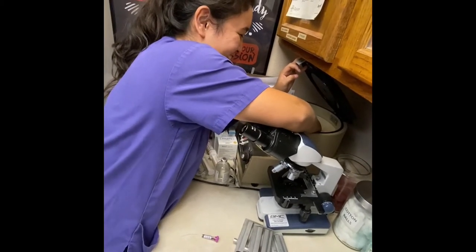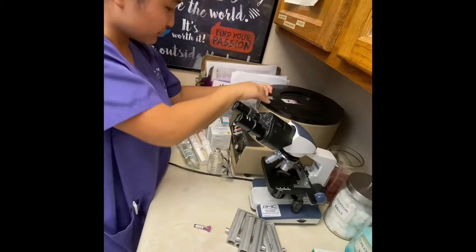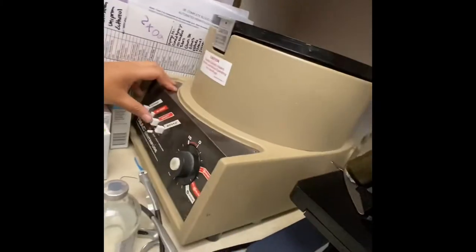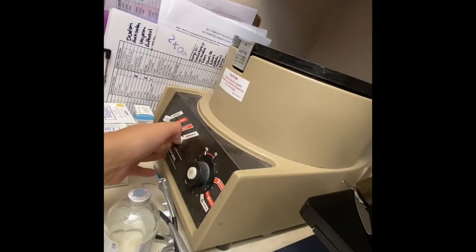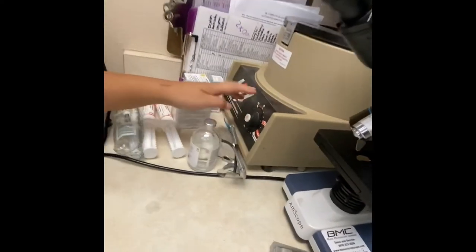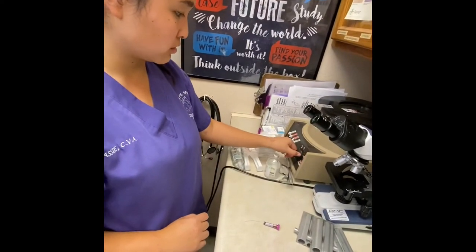You take the lid and you close that. And then for this machine, it has a little safety button. You push that button, and then you change it to the micro-hematocrit tube setting right here. And then it's going to go ahead and start running.